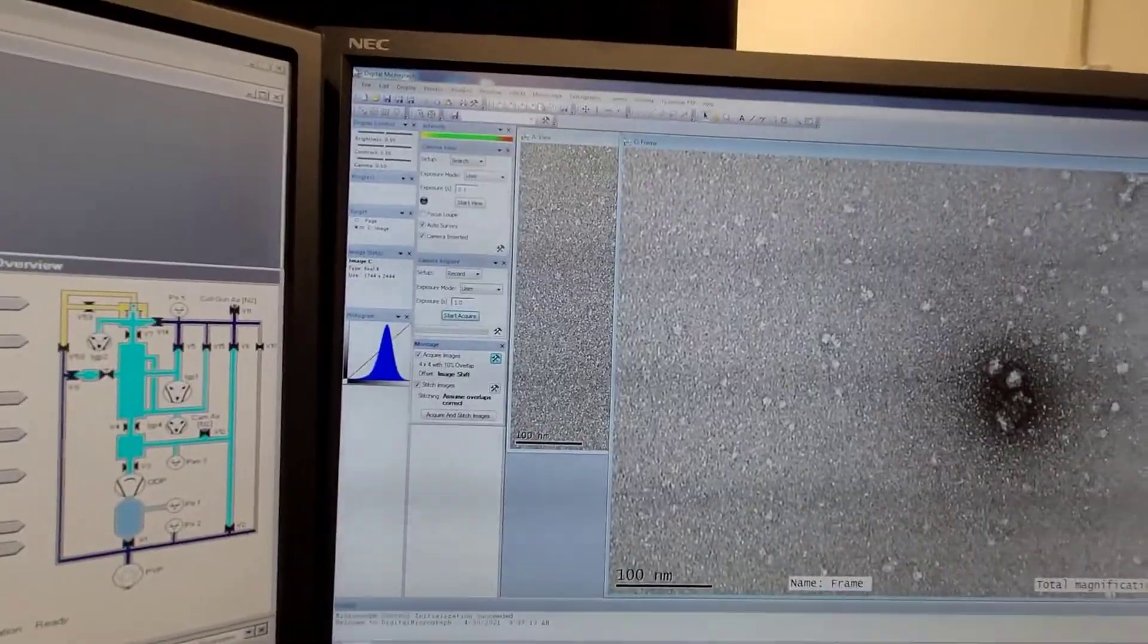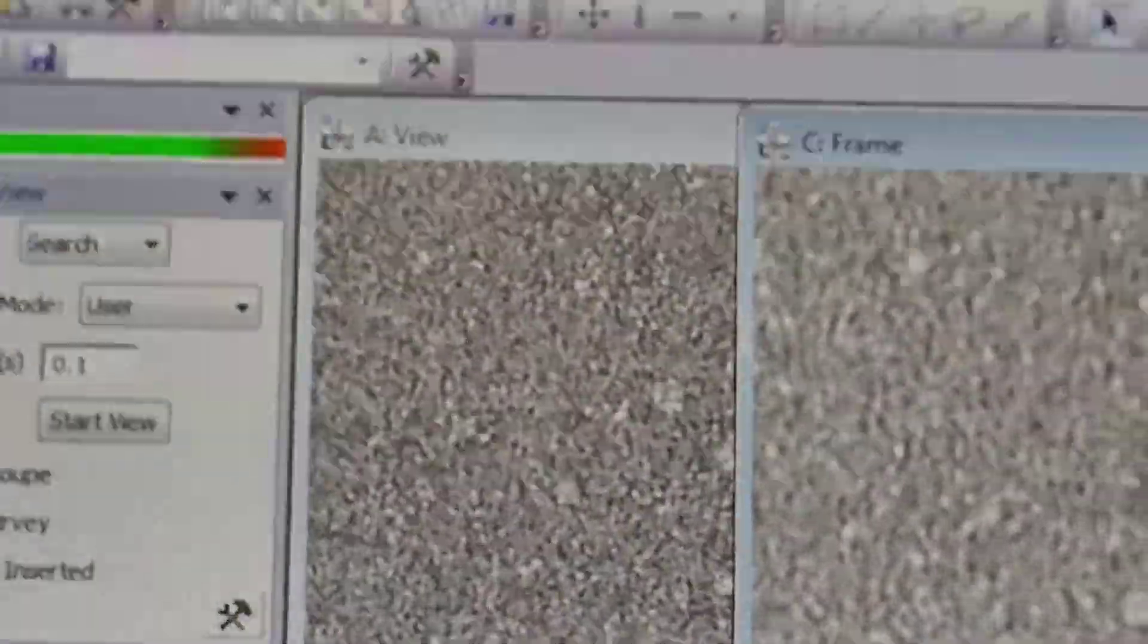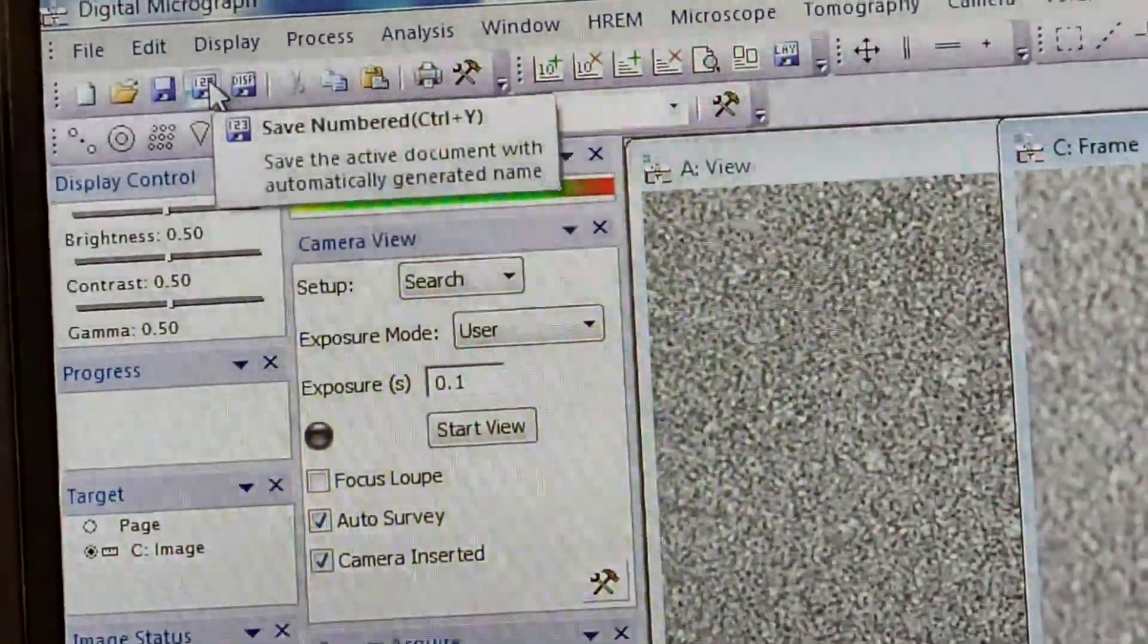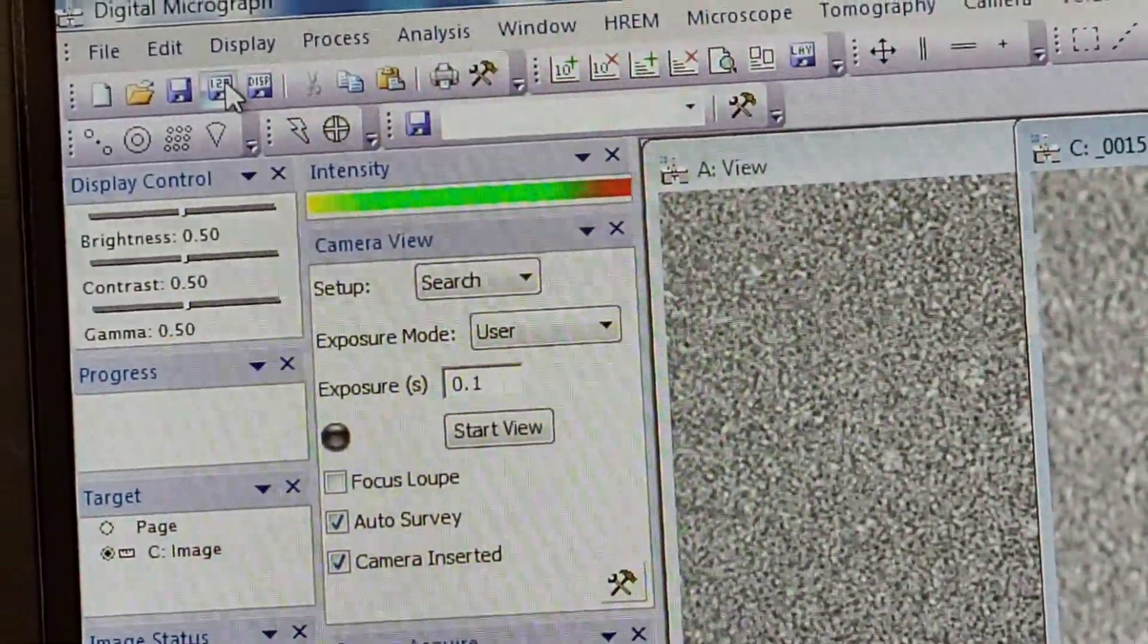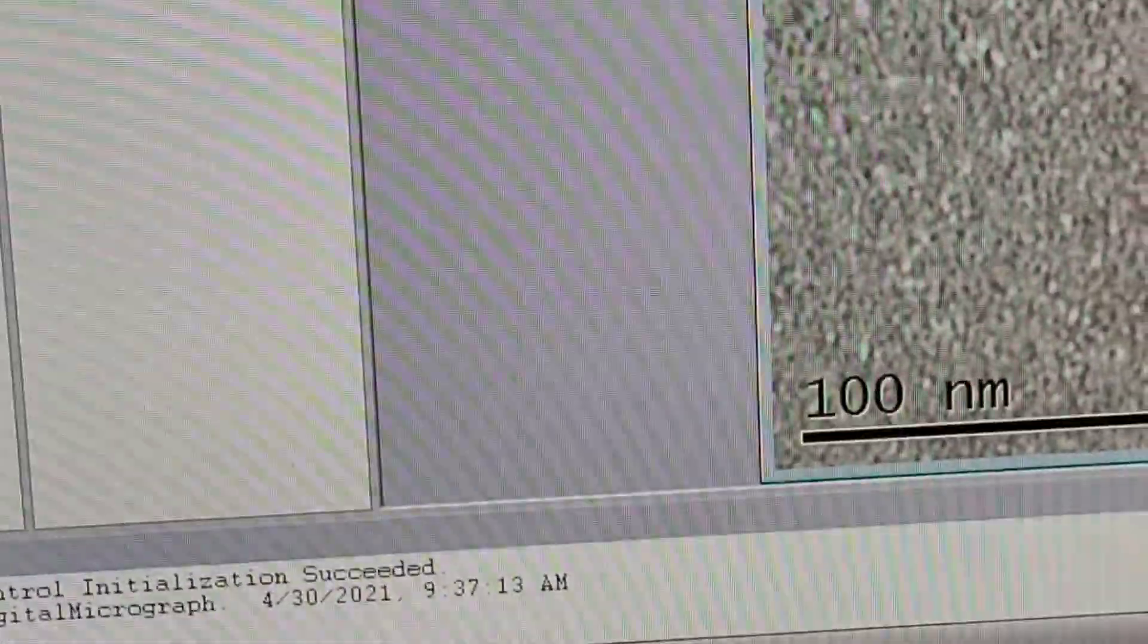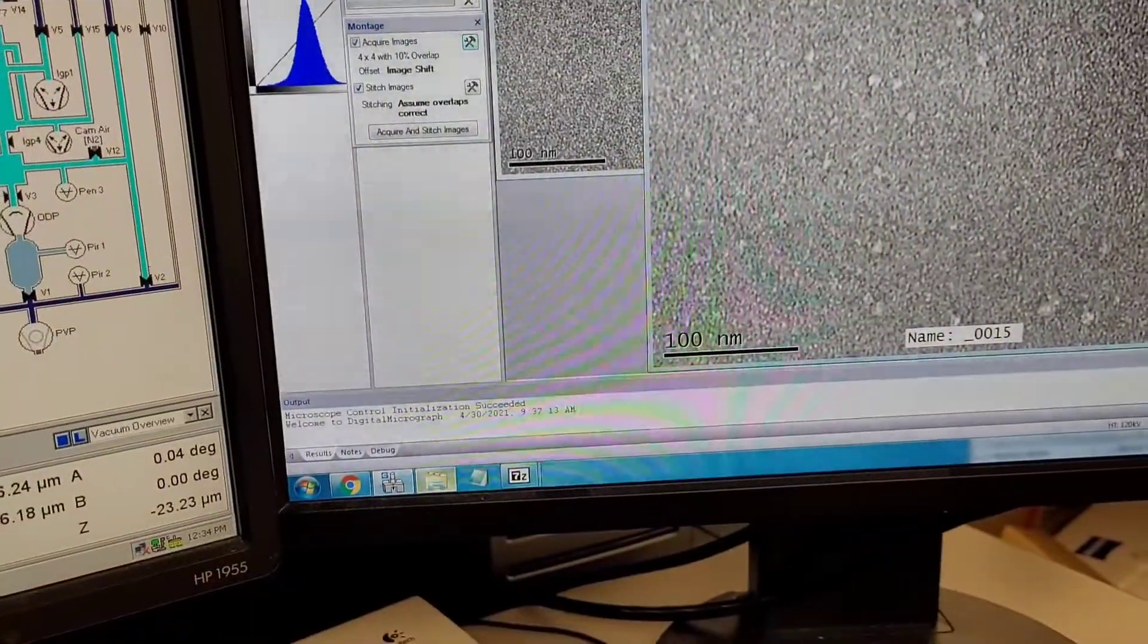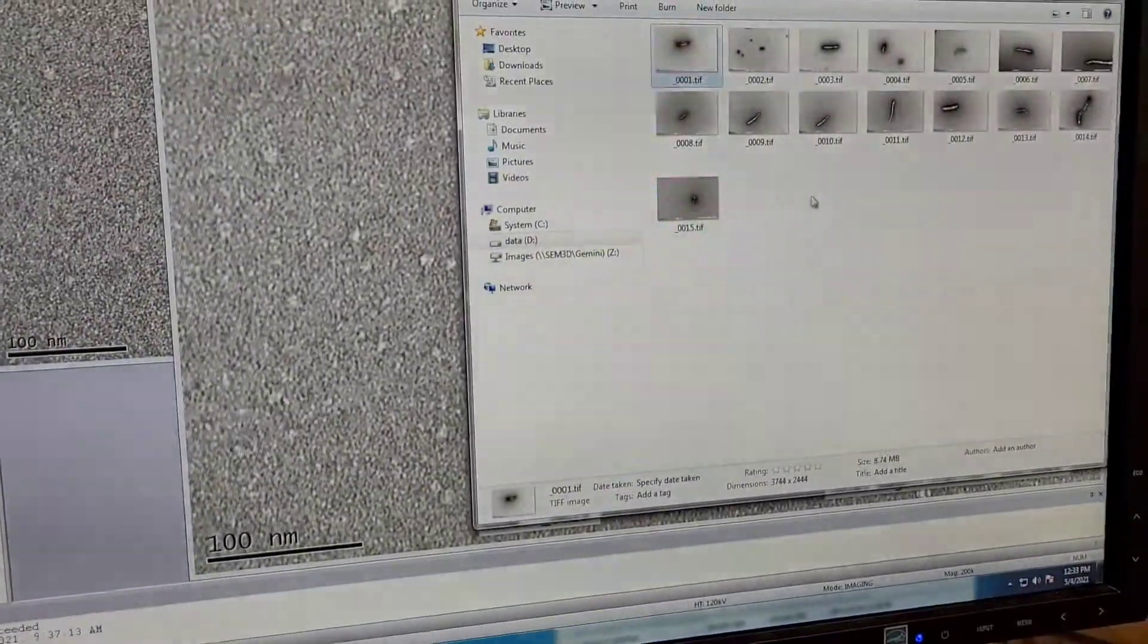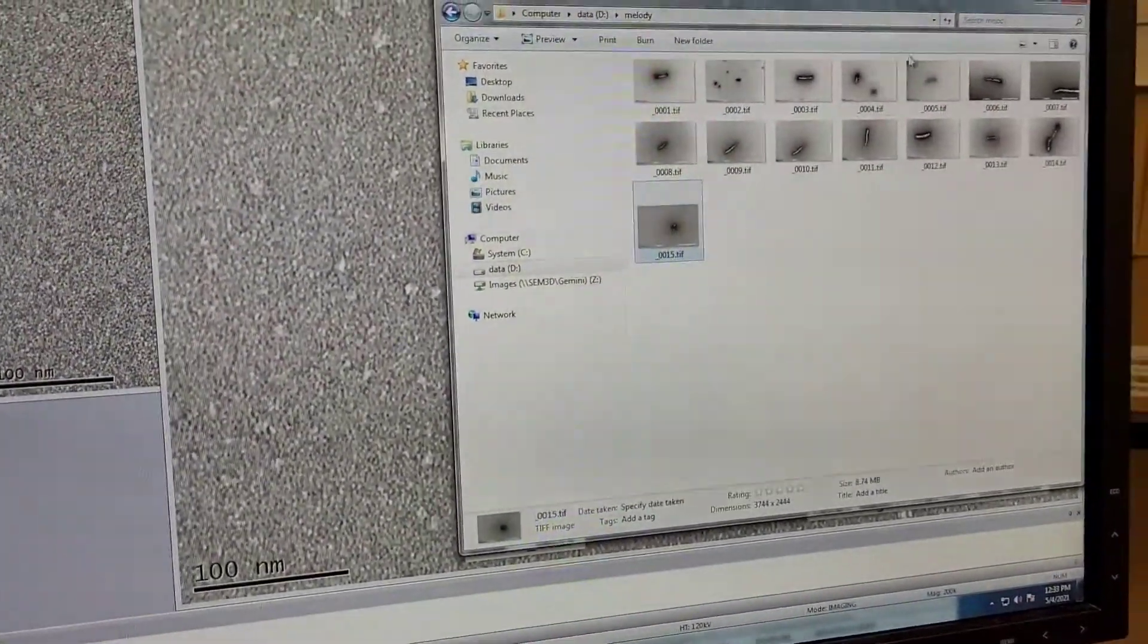You can select the save numbered button here, and then it's going to get saved in the proper folder and you can use it afterward. This is how I save it.